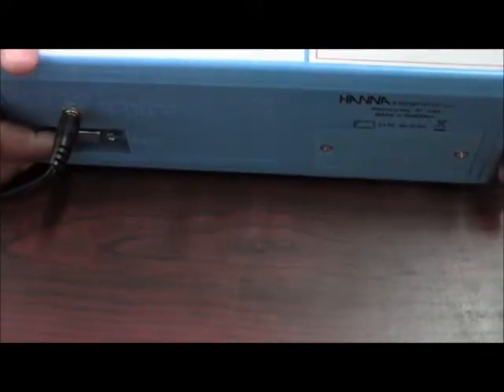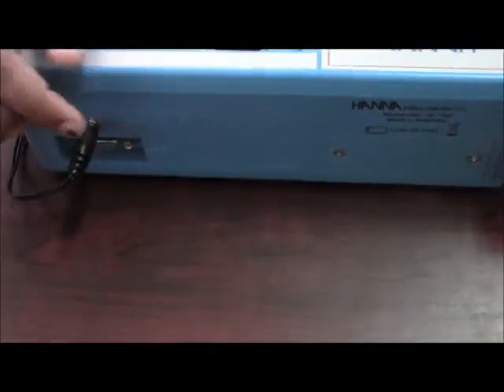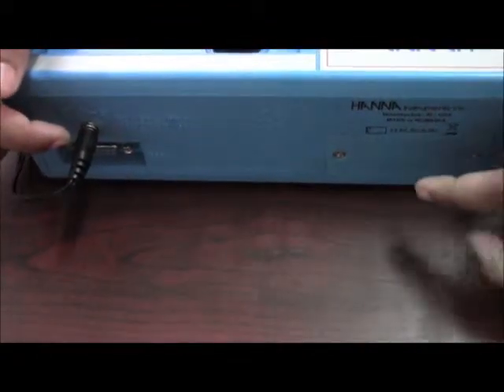This is the back panel of the meter. This is where you attach your power cable. This is the RS232 port for your PC connectivity. This meter can work on power supply as well as on batteries.